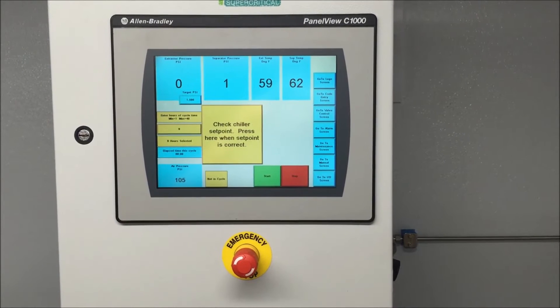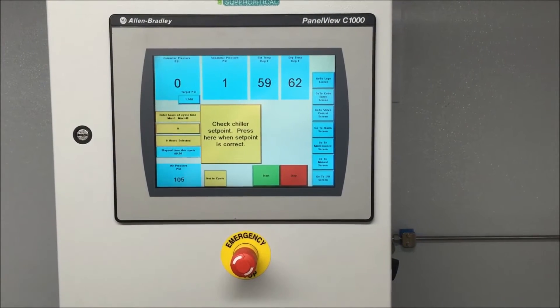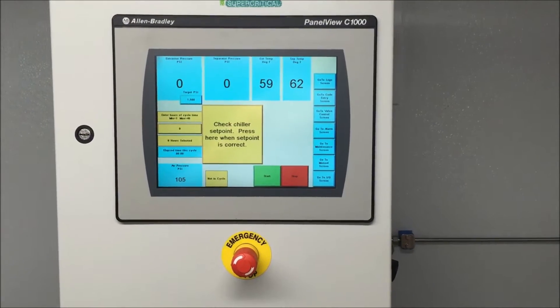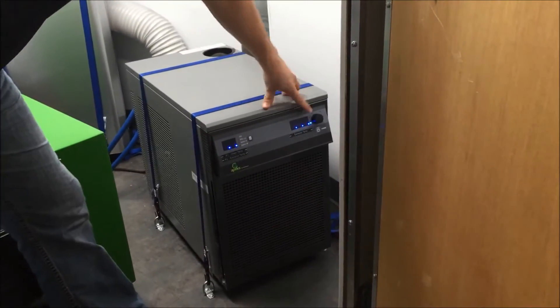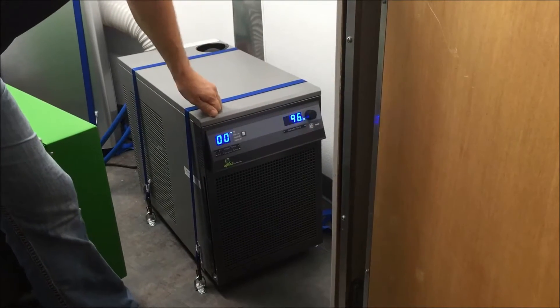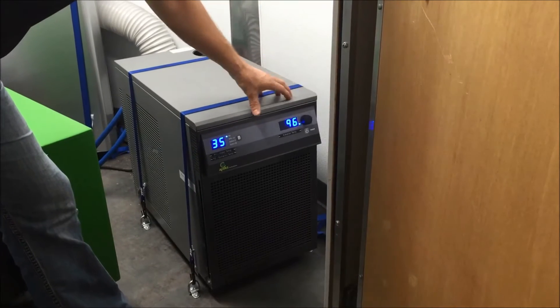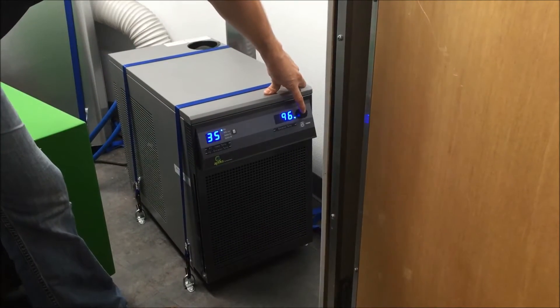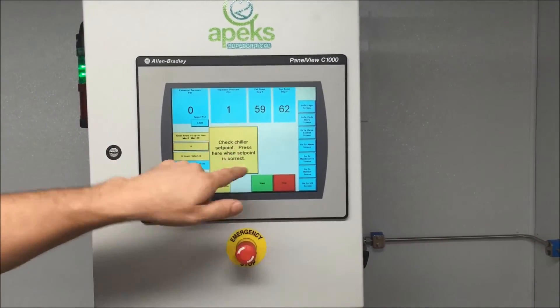Now it's asking us to check our chiller set point. We're going to step aside to the other room, turn our chiller on and pick a temperature. In here is where we're going to set our chiller — we have it in Fahrenheit. I'm going to turn it on and pick a temperature. 96 degrees Fahrenheit is a great temperature for 1,500 PSI. We're going to set that, let's go back in there. We set our temperature on the chiller, now we're going to acknowledge.